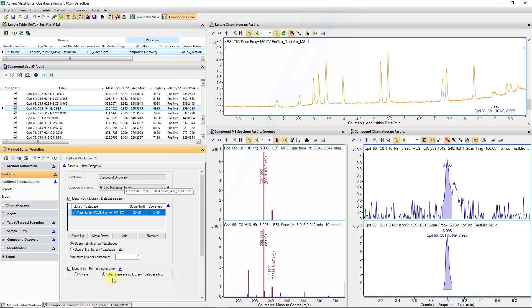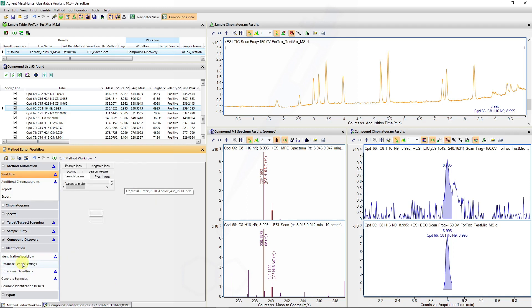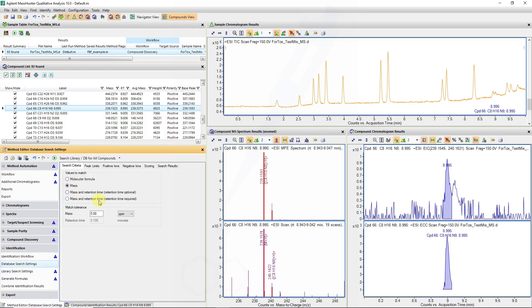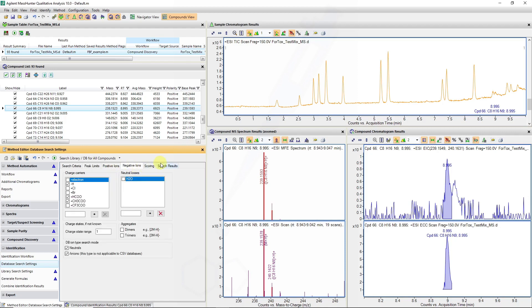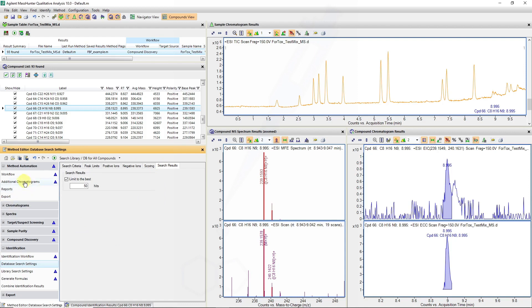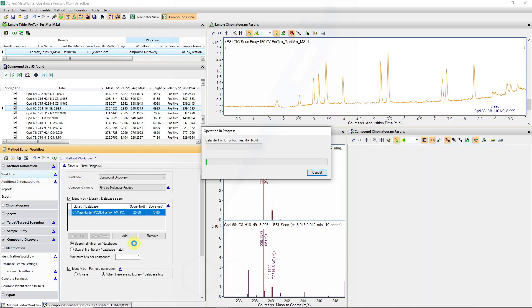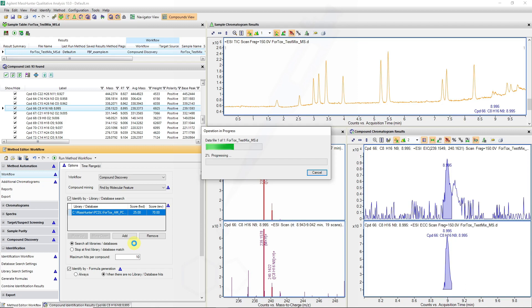I've also moved the formula generation to only run when no database hits are identified. For additional settings in database searching, you can also set whether you have a retention time in your database and whether this also needs to be confirmed. Rerunning this workflow now, which runs somewhat faster than a find-by-formula or target suspect screening workflow.